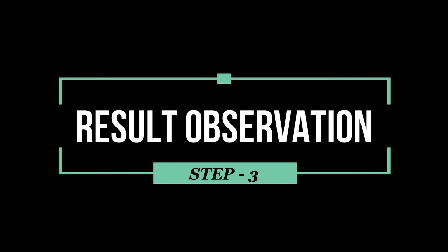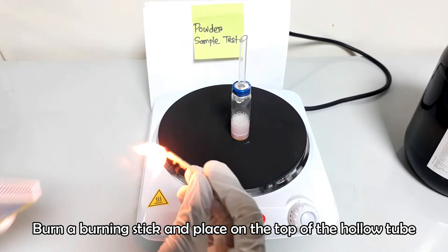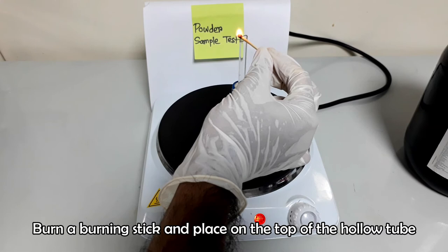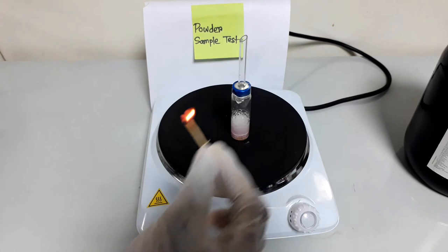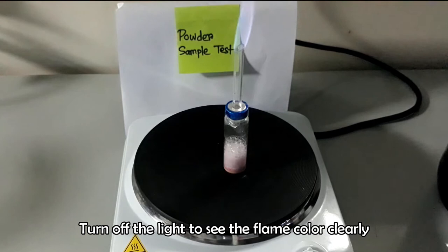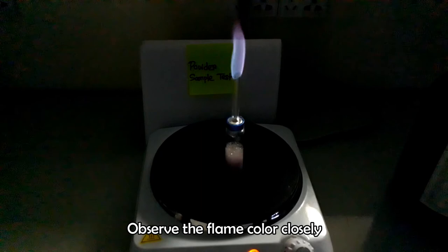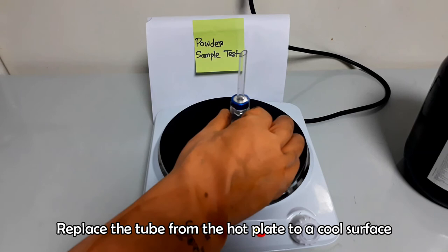The solution will start boiling, place a burning stick on the hollow tube. Now, observe it to find the green flame. In our test, the flame is yellowish and slightly bluish in color, but not green. Cool the vial.